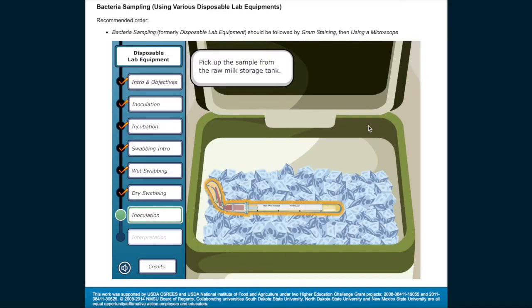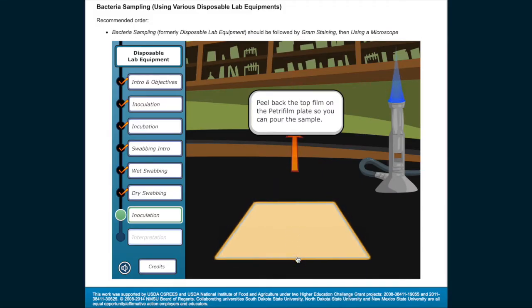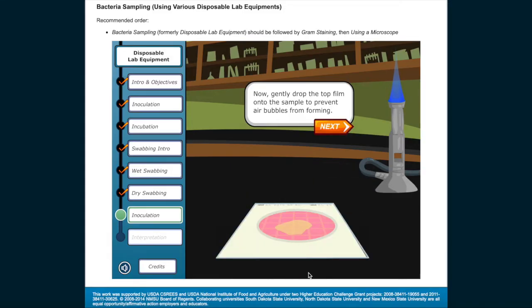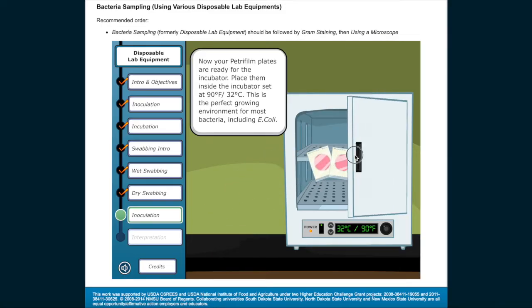Let's move on to the next sample. Pick up the sample from the raw milk storage tank. Label the backside of your second Petri film plate with the date of the sample, where the sample came from, and your initials. Go ahead and write your initials in the blank area. Gently drop the top film onto the sample to prevent air bubbles from forming. Place the spreader on top with the flat side facing up and very gently press to evenly distribute the sample. Now your Petri film plates are ready for the incubator — place them inside set at 90 degrees Fahrenheit, 32 degrees Celsius.